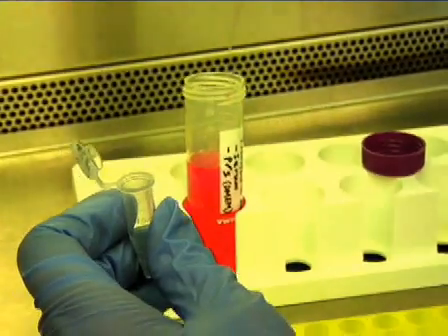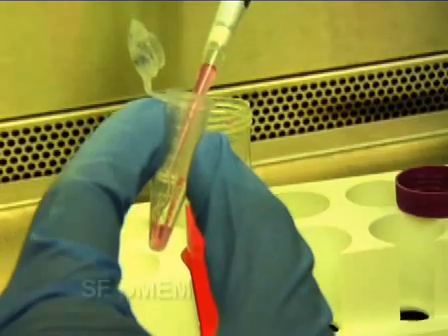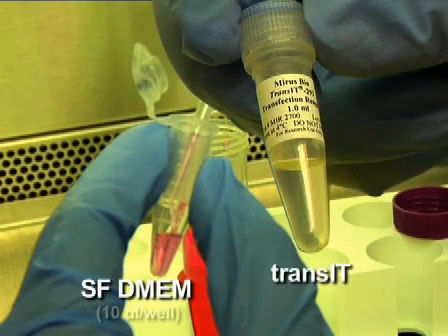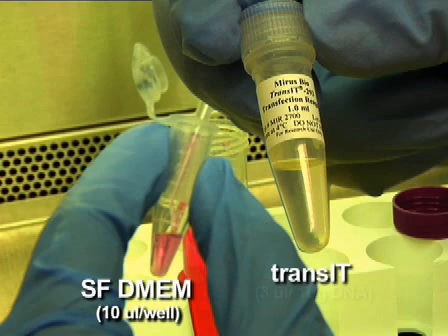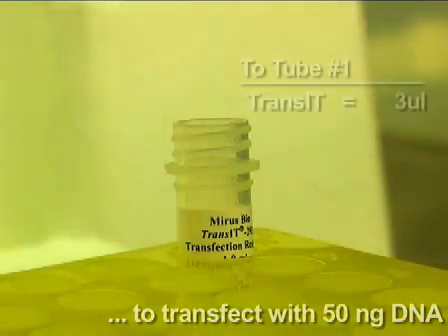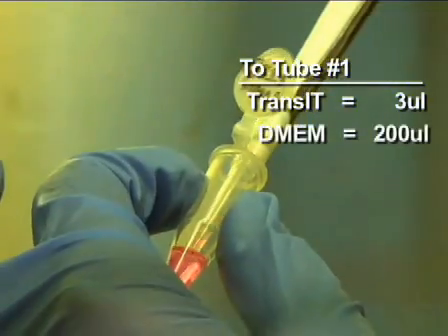To begin, prepare a mixture of serum-free and antibiotic-free DMEM with TransIT-293 transfection reagent. Use 10 microliters of DMEM for each well to be transfected and add 3 microliters of TransIT-293 reagent per microgram of plasmid DNA. For example, if 20 wells are to be transfected with 50 nanograms DNA each, add 3 microliters of TransIT-293 reagent to 200 microliters of DMEM.